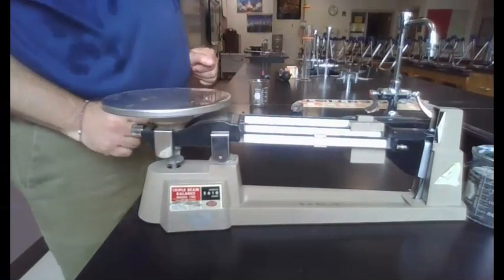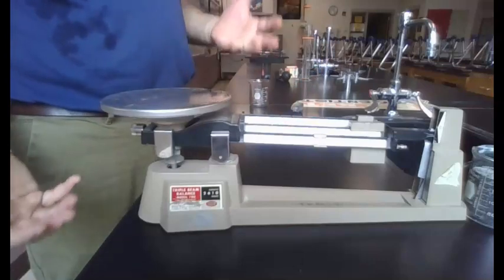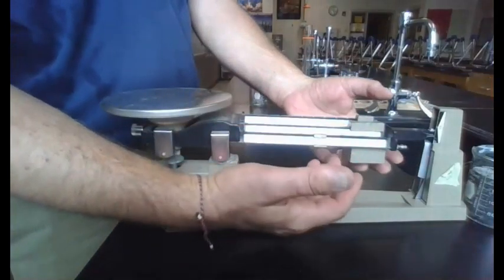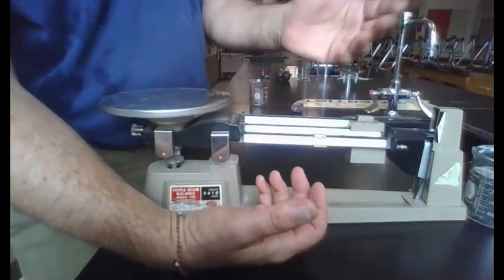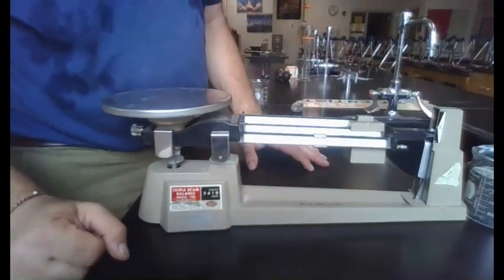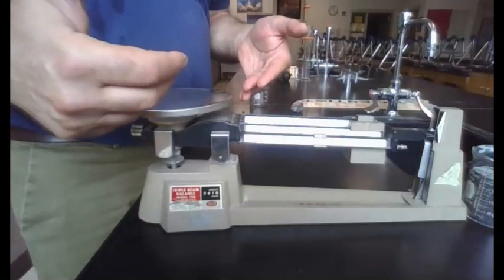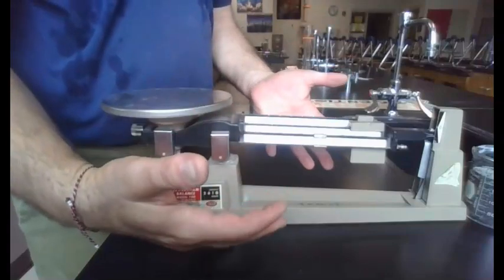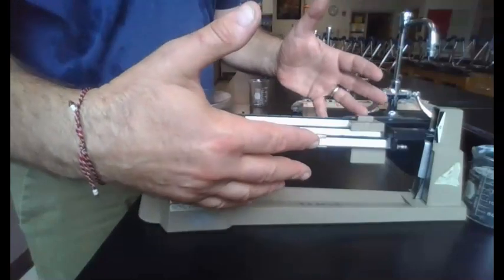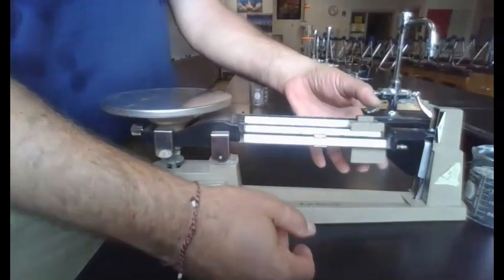This is a triple beam balance. Triple beam balance because it has 1, 2, 3 beams. And it's used the same way as the electronic balance. Well, it's used for the same reason. It'll get down to the very same 100th of a gram, but takes a little skill in using it. The good part about this type of scale is that there's no power to go out, there's no electronics to go wrong, and 500 years from now, this will still be giving you an accurate reading.